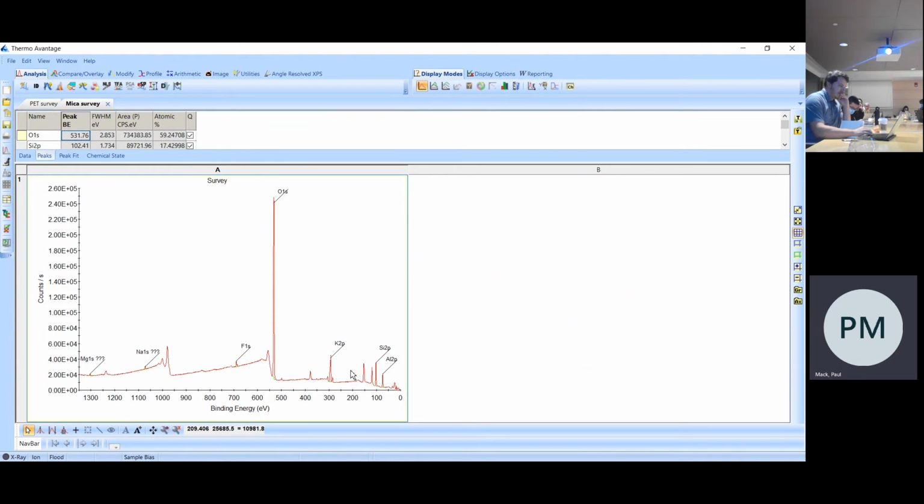That's actually a preference in the software. So you can either ask the software to label all of these peaks, because some of them are secondary. So for example, this peak on the right here is labeled Al 2p. This peak in the middle, just here, is also an aluminium peak, the aluminium 2s.